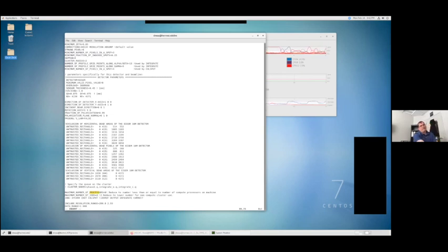And if you tried to run it with that number of processors and number of jobs on your laptop, for instance, or even on your desktop, it is going to stop functioning as long as it's trying to process the data, because it's going to use up a lot of the resources. So you want to make sure that you reduce that down to something more reasonable for the situation that you have. And I'll show you that when we get to XDS GUI.